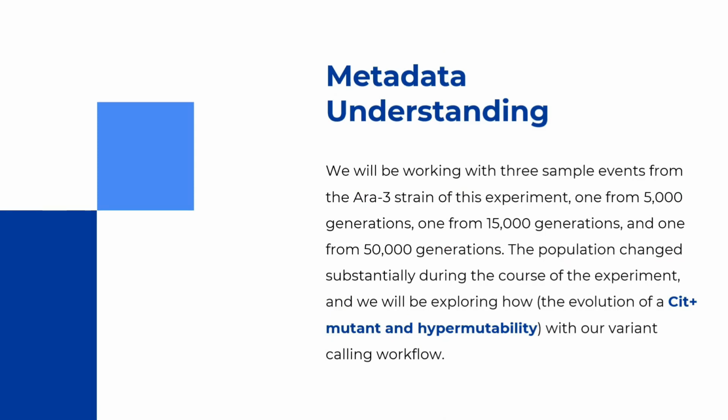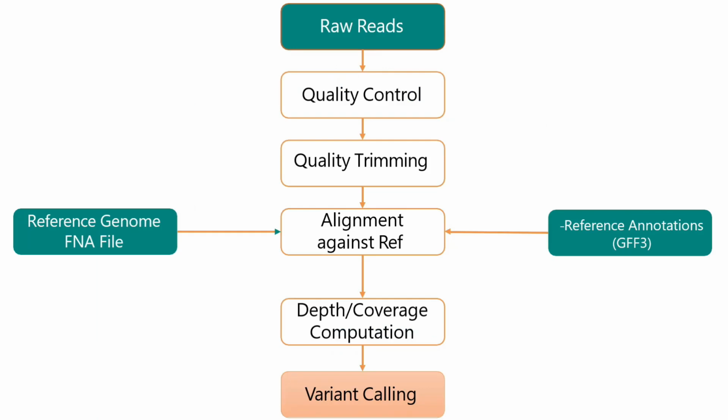Now that we have discussed the data, the basic workflow, and all that, we will be moving on to getting the raw reads into our system: how to retrieve the raw reads and how to use the SRA toolkit. That will be covered in the next lecture, where we are going to retrieve the reads. So that was it for this lecture.